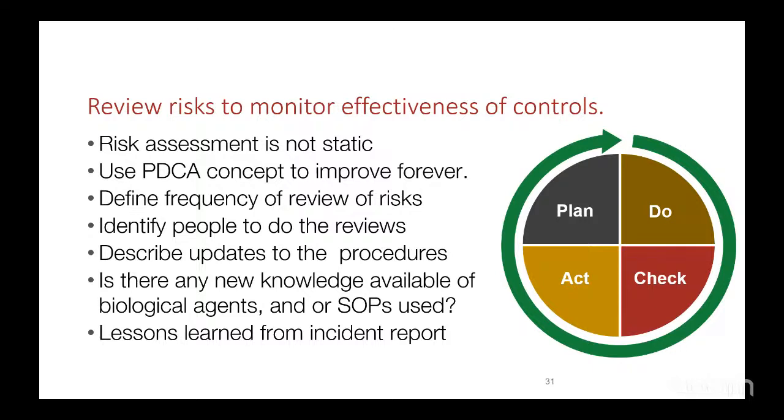So define the frequency of the review of the risk and define the people to do the review. So you plan it, you take action, you check to see that the procedure or program that you have put in place, how active it is, how effective it is. Then you can act on it, either to improve on it or to continue the plan.